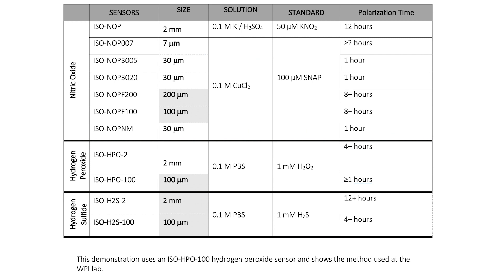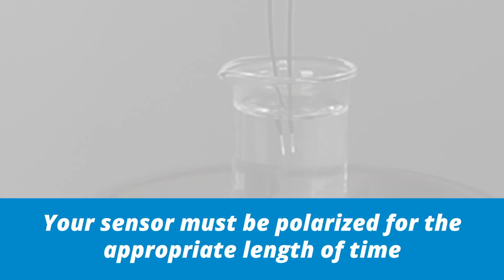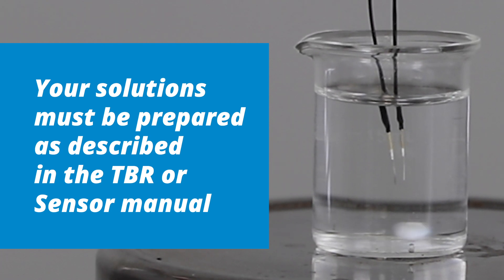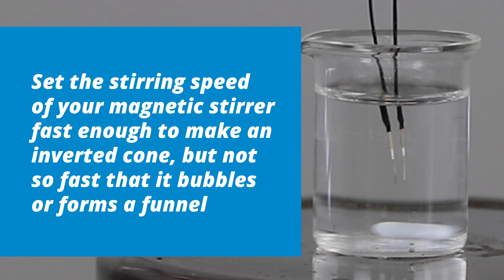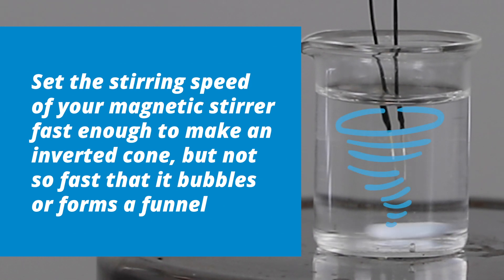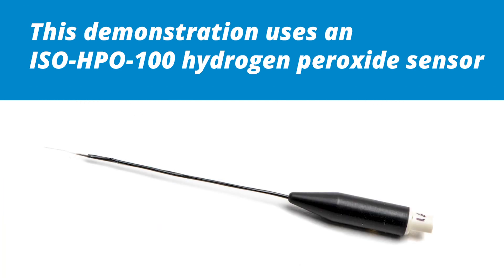Before we begin, make sure you have the appropriate solution and calibration standard required for your sensor. Your sensor must be polarized for the appropriate length of time, and your solution must be prepared as described in the TBR or the sensor manual. Set the stirring speed of your magnetic stir fast enough to make an inverted cone, but not so fast that it bubbles or forms a funnel. This demonstration uses an ISO HPO100 hydrogen peroxide micro sensor and shows the method used at the WPI labs.